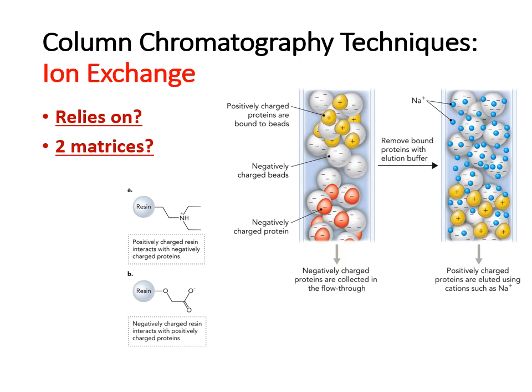Okay, so gel filtration, also known as size exclusion, which includes also HPLC, all of those, we were using size of the proteins to separate out proteins within a protein mixture. This one here that we're looking at is ion exchange chromatography, and whenever you see ions, that means there's a charge involved. So this is for exploiting the charge differences between proteins and to separate proteins within a mixture based on which protein has a positive charge or which has a negative charge.